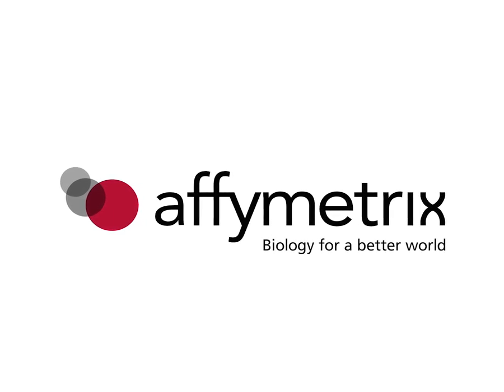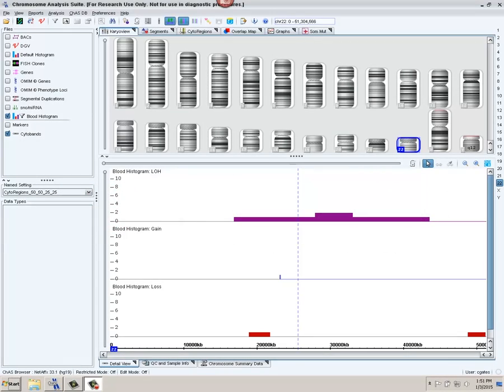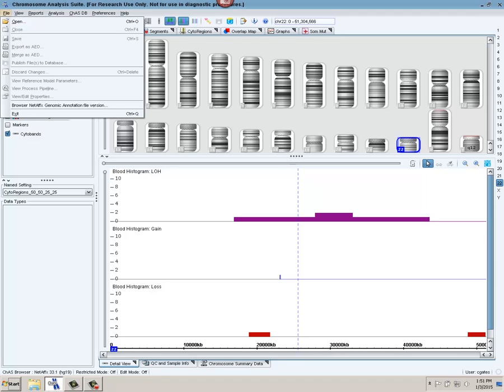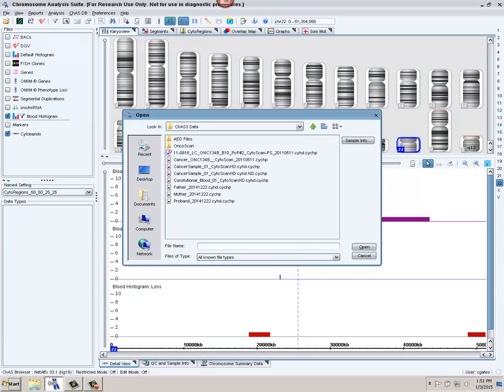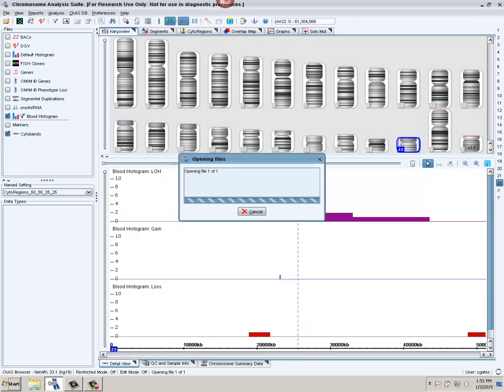This brief demonstration will show how easy it is to load a sample into the Chromosome Analysis Suite browser, and through the use of a cytoregion and an overlap map file, as well as querying the database, how quickly one can put annotation and interpretation to a particular sample. First, we're going to load our sample by going to File Open, and we're going to load this constitutional blood sample.